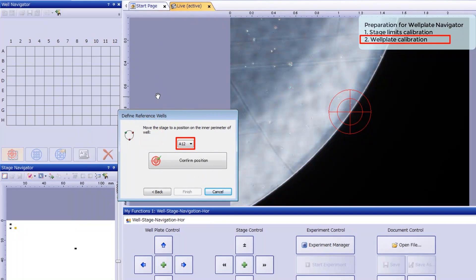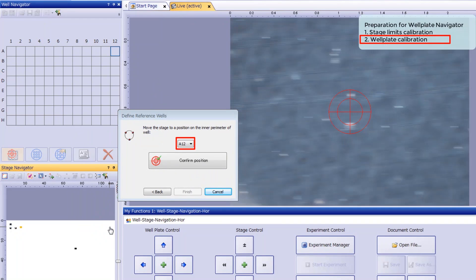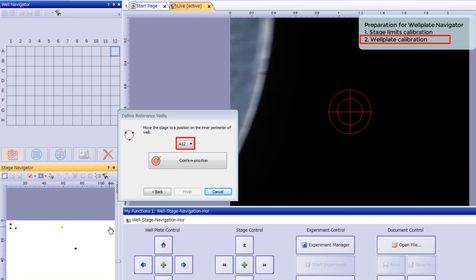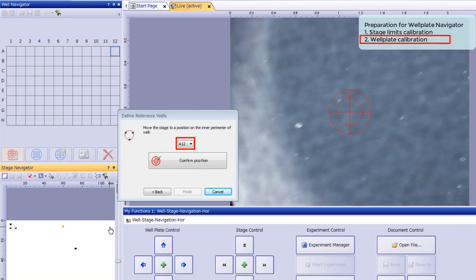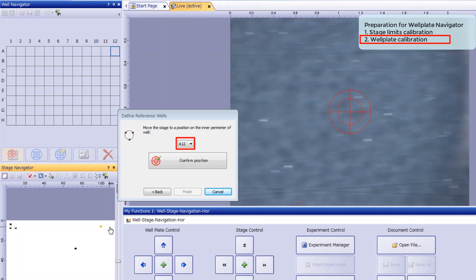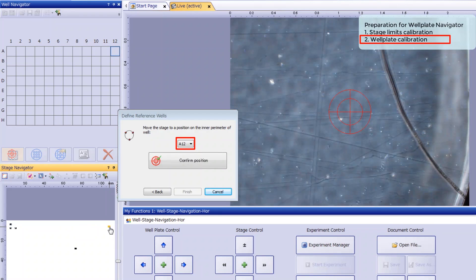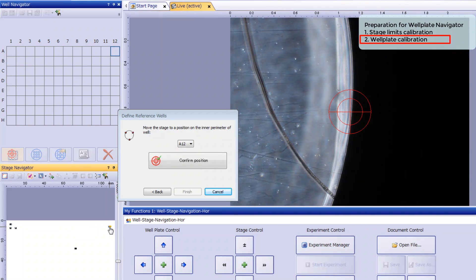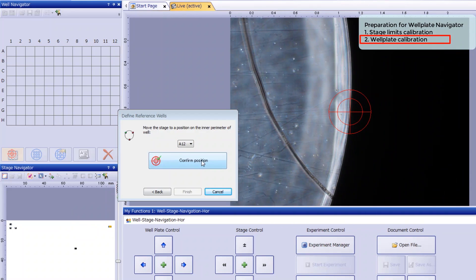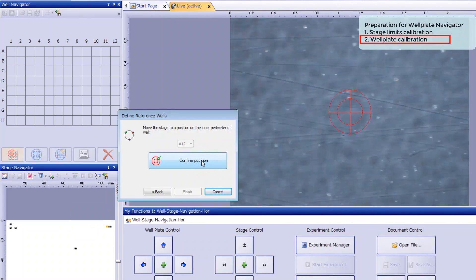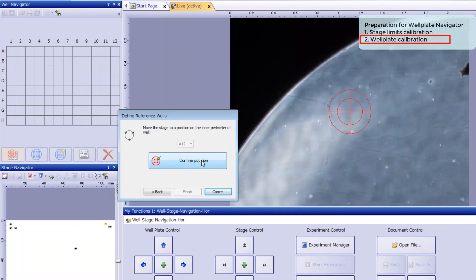Next, drive the stage to the upper right well, which is A12 in a 96-well plate. Clicking the upper right part of the stage navigator tool window may be easier than using the stage handle. Confirm you're observing well A12, then register three more positions.